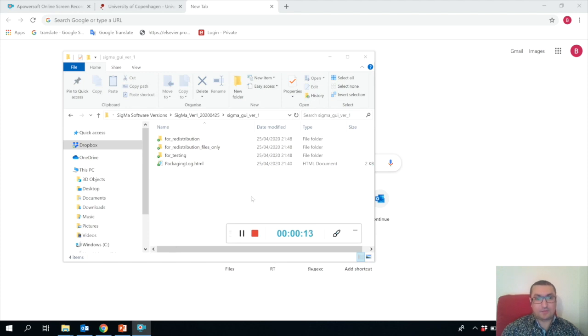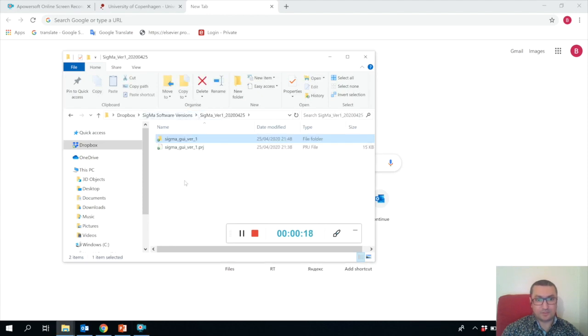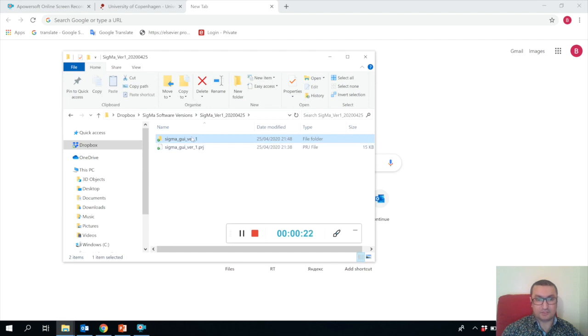First of all, how you should install it. You will receive the Sigma folder - the entire folder installation is compiled software.